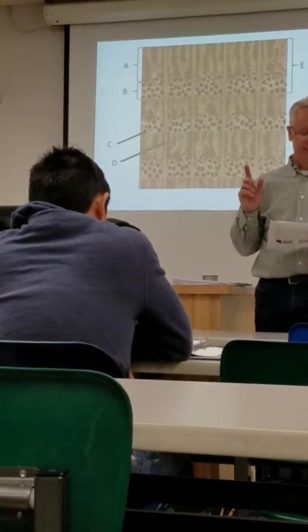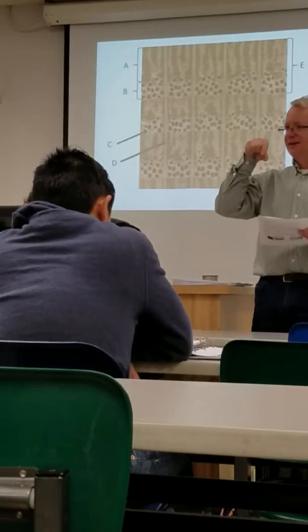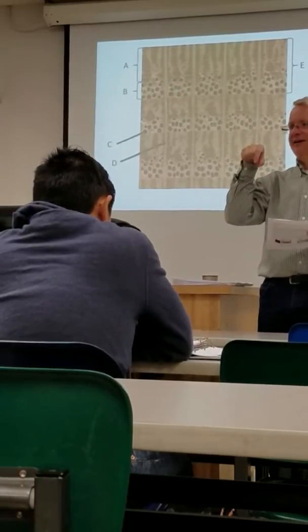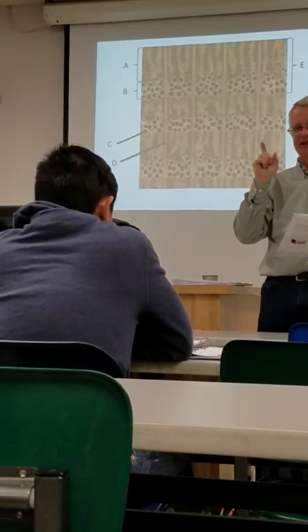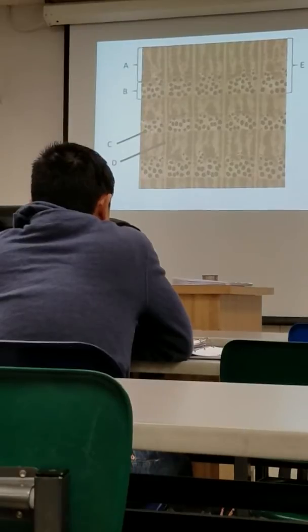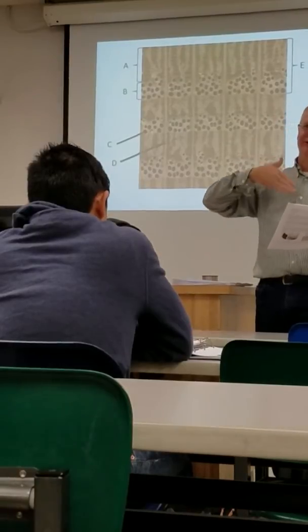And note that the Picea and the Quercus, I believe, they each have 3 different sections on the slide. They all have a cross-section, a radial, and a tangential, but I just want you to look at the cross-section of those. Okay? So I already have it focused on the cross-section. You can move it around some, but don't move into another section.